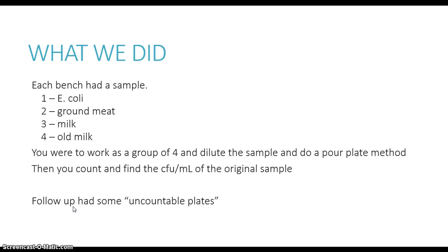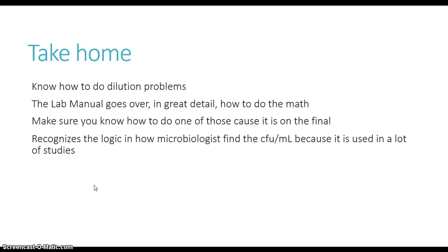So in the follow-up, some of you had uncountable plates, which happens, you just have a bad experience with it. I don't really get why, because conceptually it all makes sense. But uncountable plates do happen. Just write down in your lab manual that you had an uncountable plate, and then it'll be fine for grading your follow-up. Now, the take-home message, though, is to know how to do dilution problems, because you do have it on your midterm and final, I think.